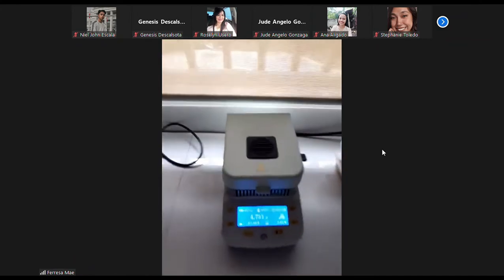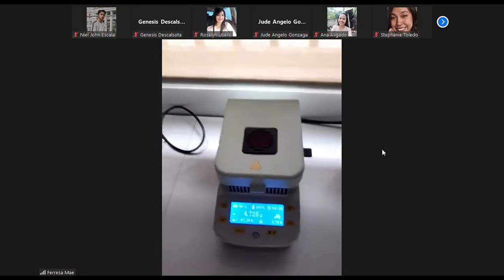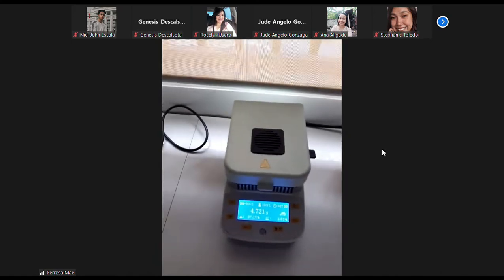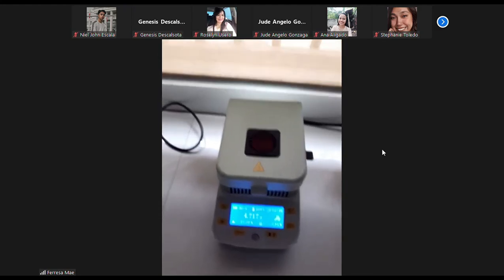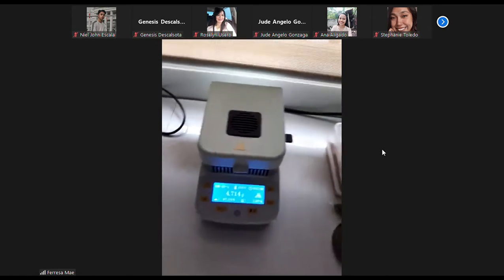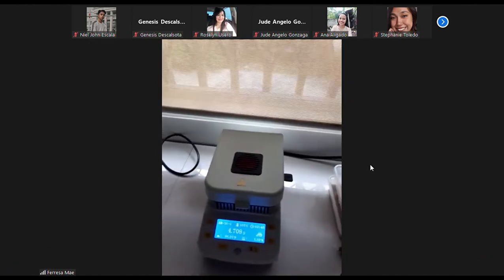Bali ang weight kagina nga appear nga 4 point something, amo na siya ang final weight, meaning wala na siya water. Nakuha na ang moisture sa iya. So bali final weight siya ang 4 point something nga grams. Okay, Miss. Bali ang initial weight naton is 5 grams, then ang final weight niya is 4 grams. Bali, ang gina-show, Miss, ang final weight, wala moisture. Okay, thank you, Miss.